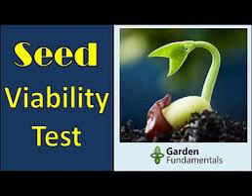Different methods of testing seed viability: Tetrazolium test (TZ), indigo carmine test, urine sugar analysis paper test, radiographic soft X-rays test, embryo excision test, glutamic acid decarboxylase activity (GADA) test, ferric chloride (FC) test, seed leachate conductivity test (LC), leaf color test, seed crushing test, accelerated aging test.